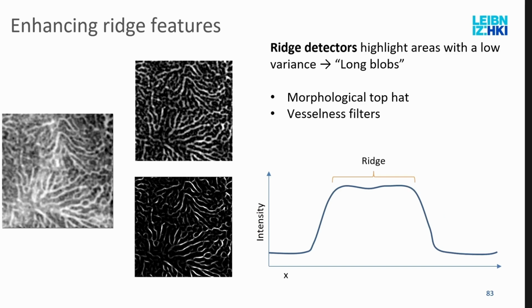Then you have a feature that I call ridges. Well, these here are, what was this? This is liver data, and these are the canaliculi, I think, from some liver data. Zoltan can explain it because I had data from him. And then you see here these ridge-like features that were of interest because something needed to be measured inside of them. And there are special operations you can actually use to find them or really enhance them.